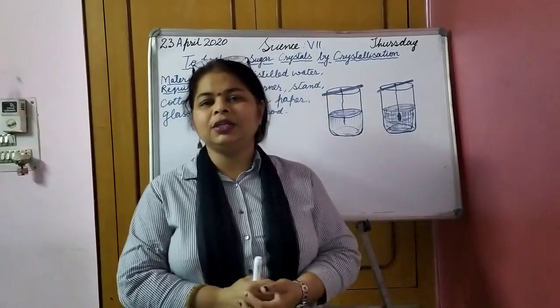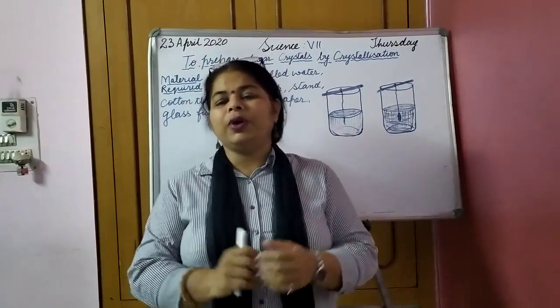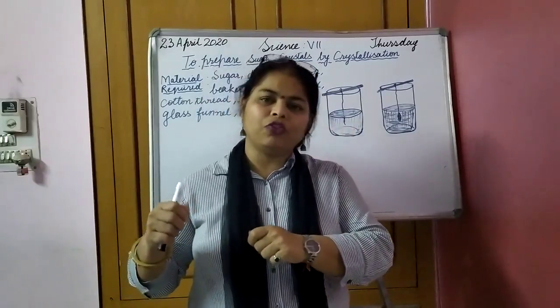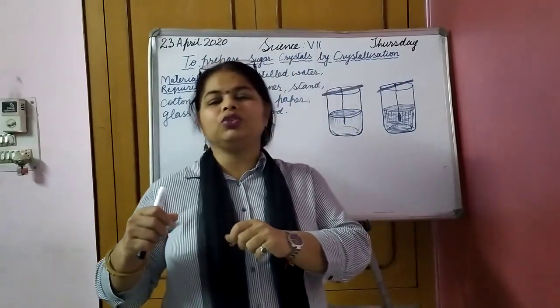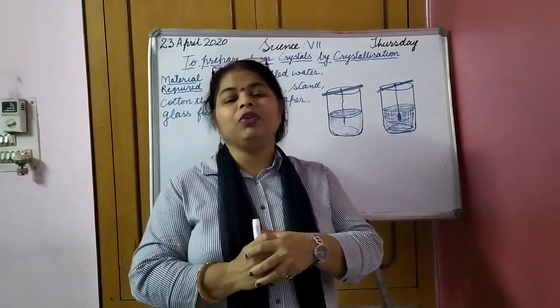So to avoid that, somebody should be there to help you. Okay, now when this beaker has been removed from the burner, what we are going to do is just filter it. Okay, we will filter it.